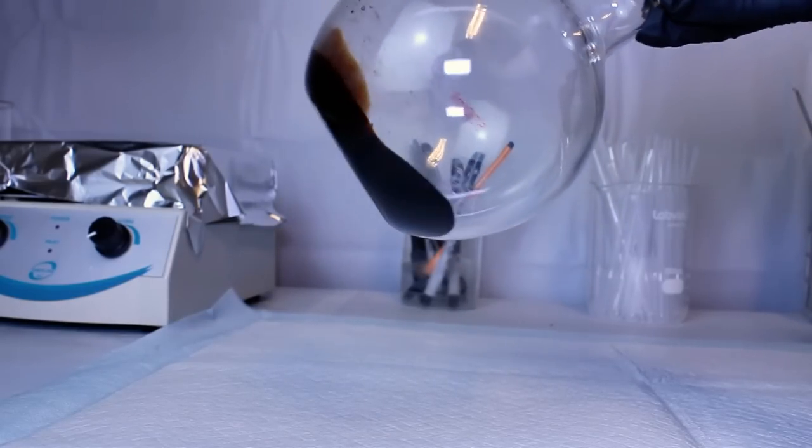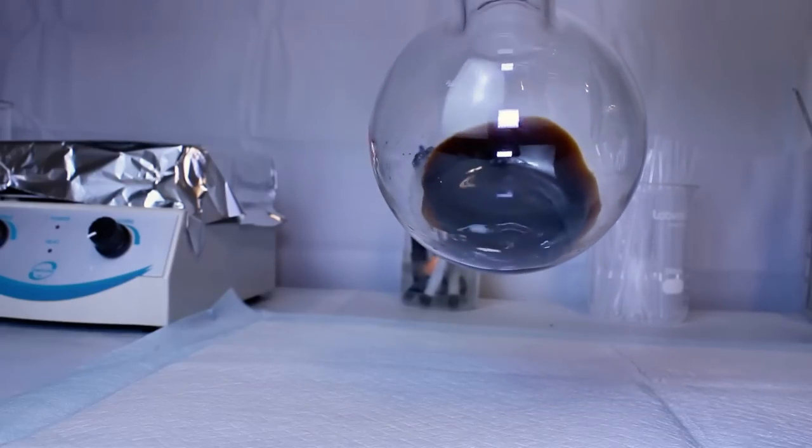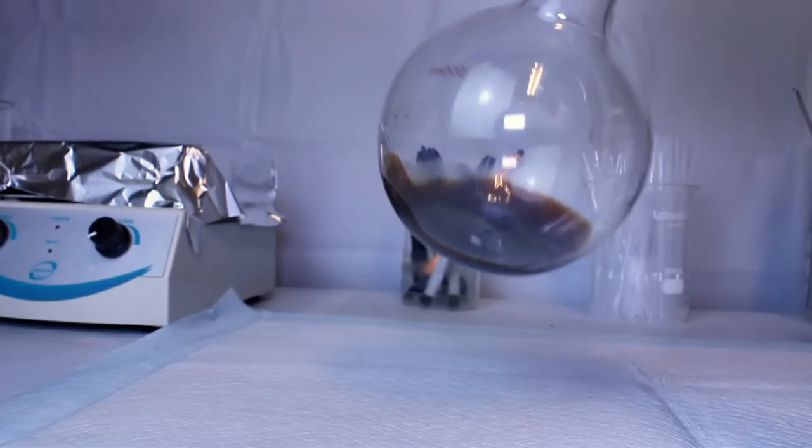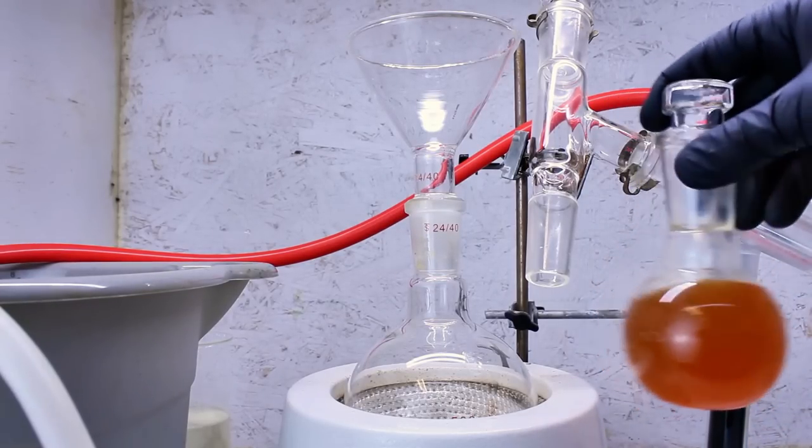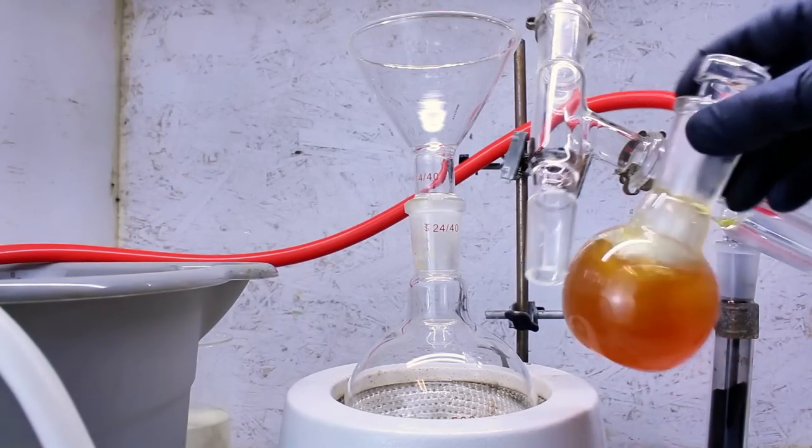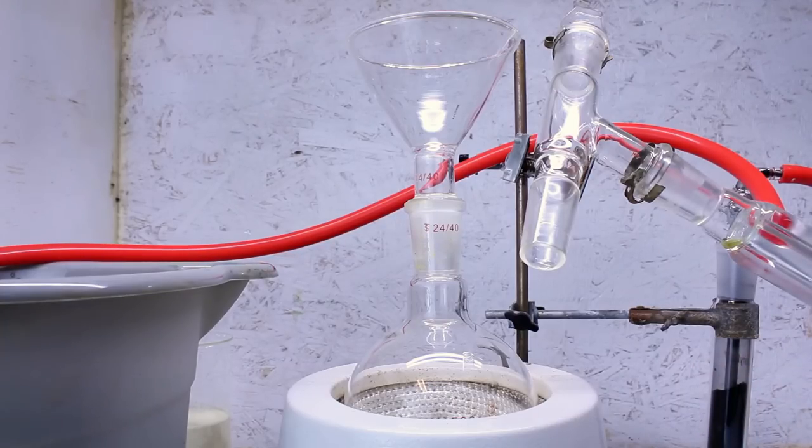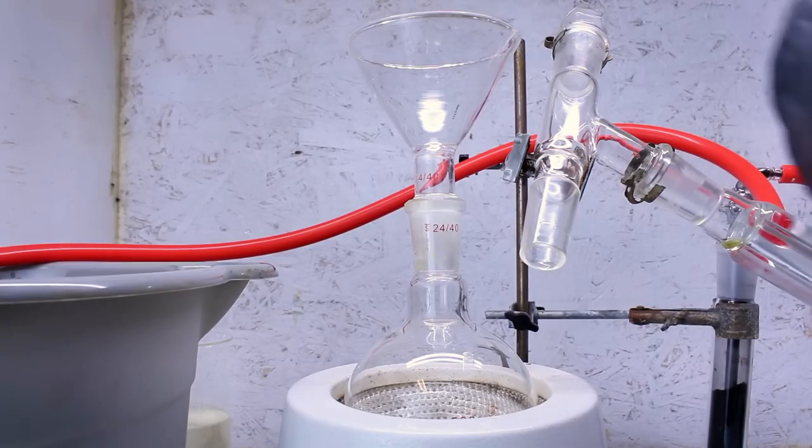If purity is not a problem, you can pretty much be done here. For my purposes, however, purity is important, so the final step is to remove those toxic byproducts I talked about earlier. To do this, I'm simply going to carry out a second distillation of my crude styrene, which is a distinct orange color for some reason.